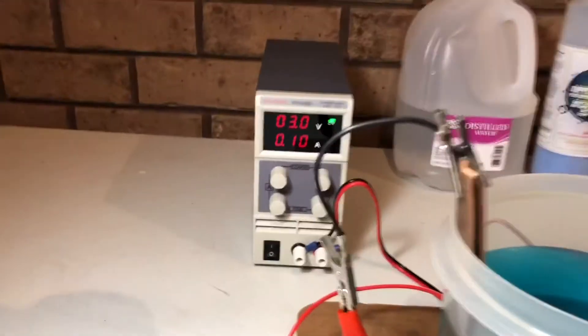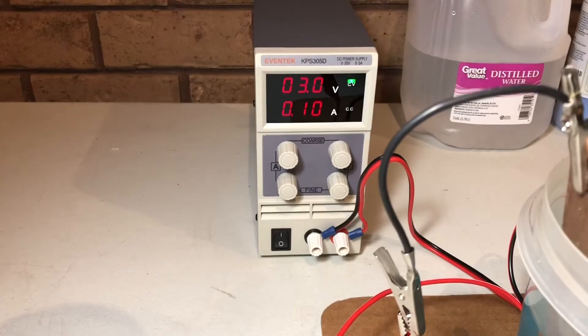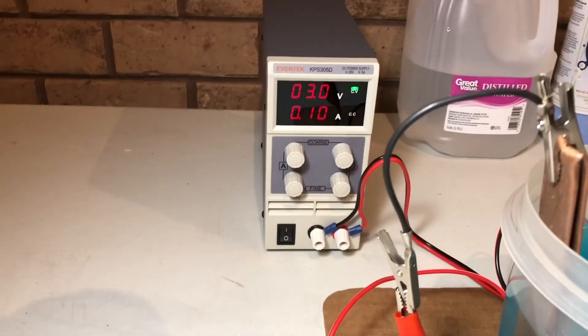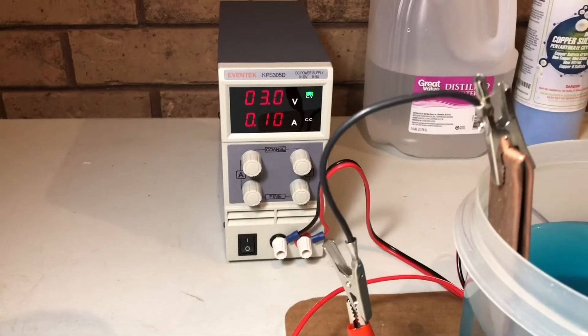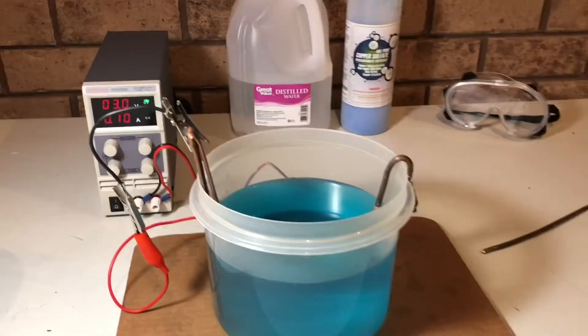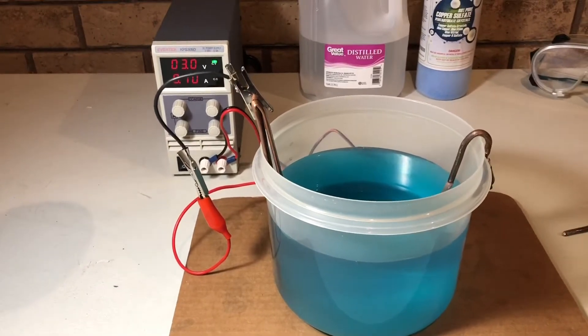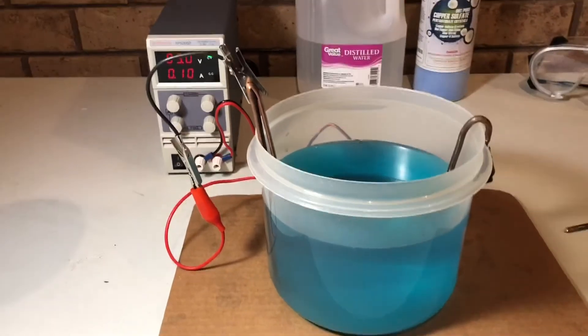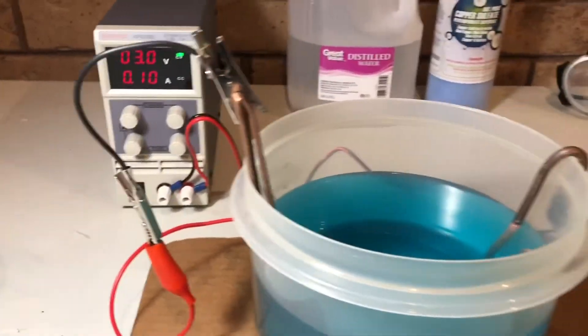Here's a brand new power supply I bought off Amazon. That power supply cost about sixty dollars. I've been running three volts — I just kind of picked a middle-of-the-road number. This is my first time doing this, so in the future I'll experiment with different voltages to see if I grow different sized crystals and if it affects the speed of growth. Just got a little alligator clip there hooking that up.